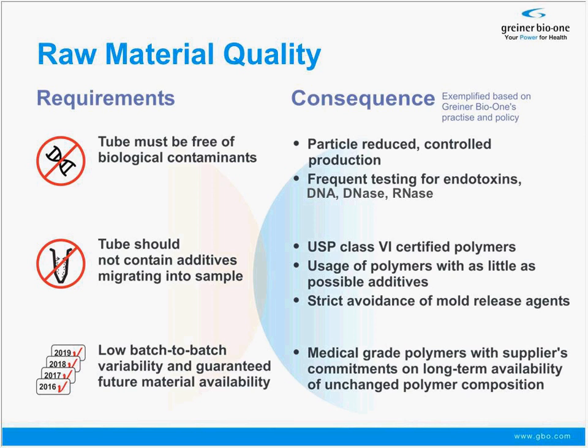On the other hand, you also want to make sure that no non-biological substances, chemicals, are contaminating your samples. So it should not contain additives that are migrating from the polymer into your sample. And especially if you think about long storage periods, such migration could happen because there's a lot of time given, and they could finally change the composition of your biospecimen.